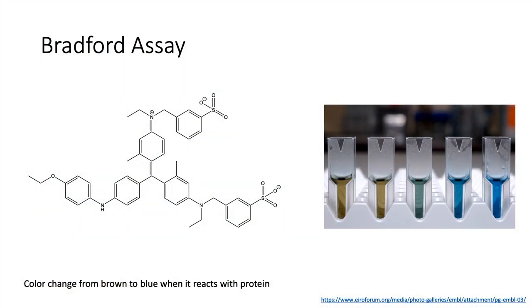So the Bradford assay is the assay that we're going to be doing in the lab, and the Bradford assay uses Coomassie dye, and this is the structure of Coomassie dye.